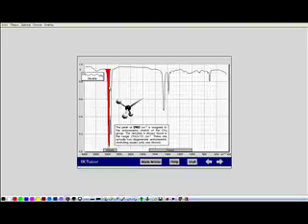So it's going to turn out that 3,000 wave numbers is the dividing line between aliphatic CH, which means alkane CH, and alkene CH, just above 3,000. And so if the peak is above 3,000, you're going to have double bonds and aromatic rings. If you have peaks below 3,000, then you're going to end up with just alkanes. Now remember, the alkane is the skeleton of an organic molecule. We make the skeleton out of CH single bonds, and then occasionally we throw in an OH or a C double bond or something like that as a functional group. So most times you're going to see peaks below 3,000. If you don't see peaks below 3,000, that's a unique infrared, because that means there aren't any sp3 CH bonds in it, or very few. So we normally find things below 3,000.